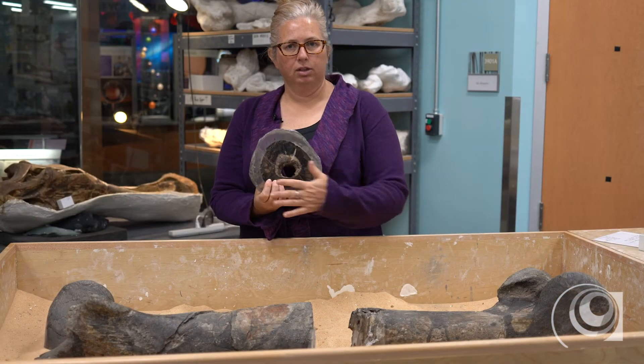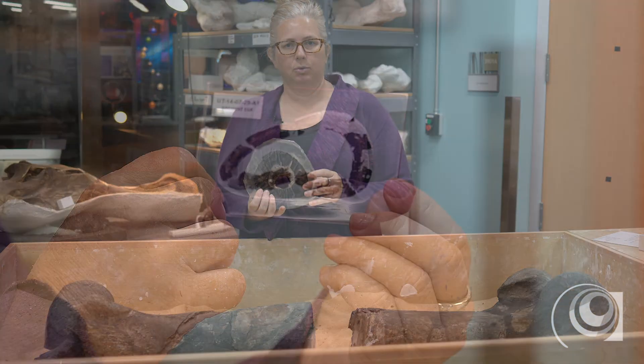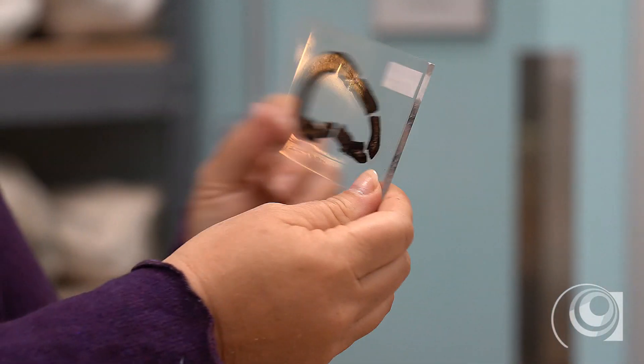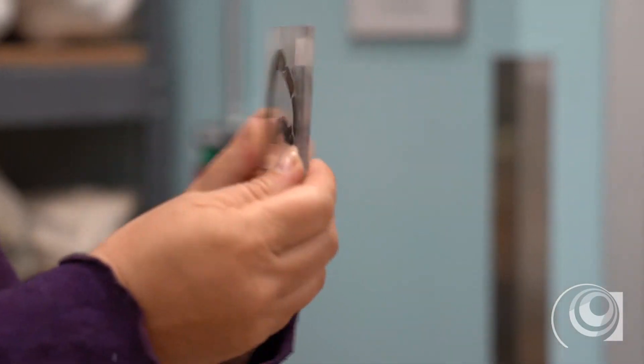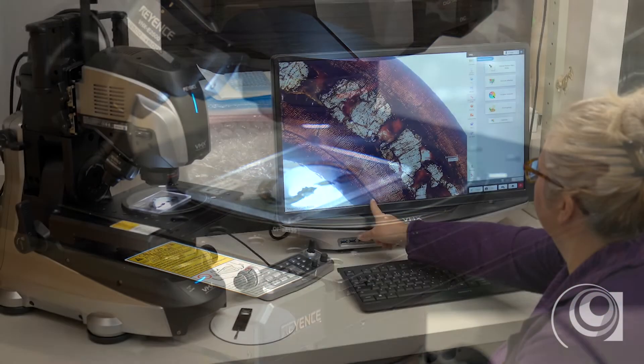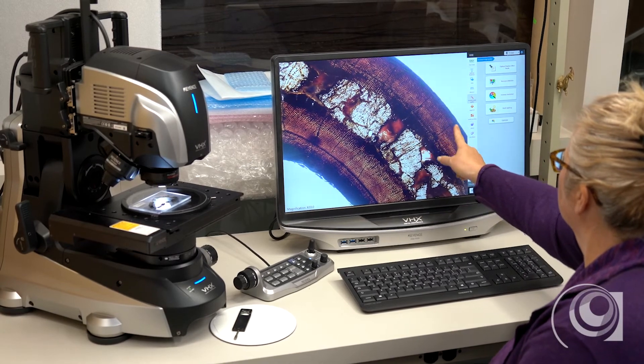I'm going to be polishing this real smooth and gluing it down to a slide, and then we're going to polish it even more so it's very very thin and transparent and we can look at it with light transmitting through the slide on a microscope, and we can actually see the cellular structure of the bone.